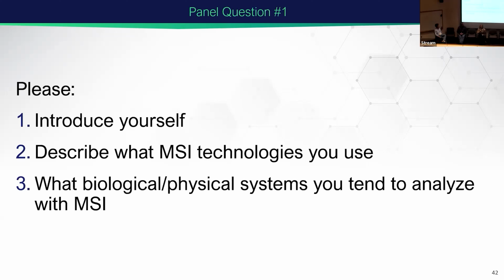So spatially visualizing things. Of course, I'm a huge fan of MALDI imaging. It's one of my favorites. And then also with DESI, and you can use all these things that these guys have developed to see specific types of molecules. You can enrich for them. You can see the differences and get that spatial localization and the co-localization. So that's what I think the power is: you can see lipids, metabolites, and proteins all within a little tiny region. And that's where you can get the biochemistry insight. What's my pathway? What's turning on? Fantastic. Thank you, Kristen.